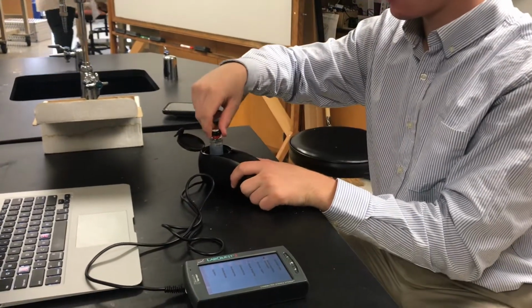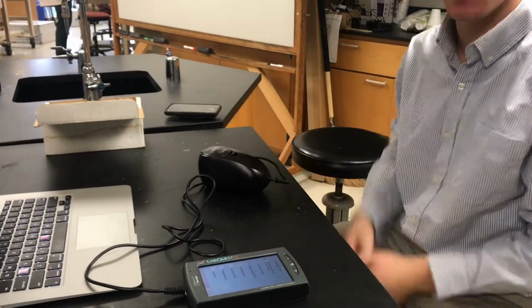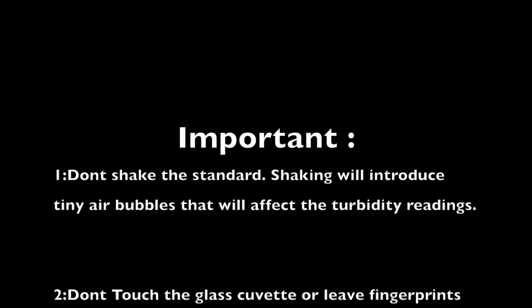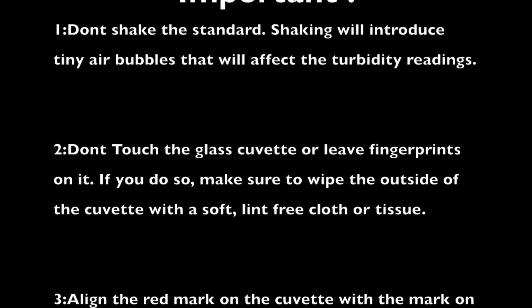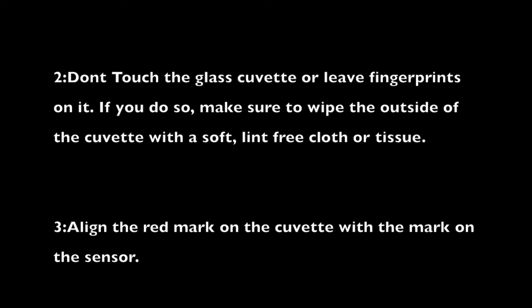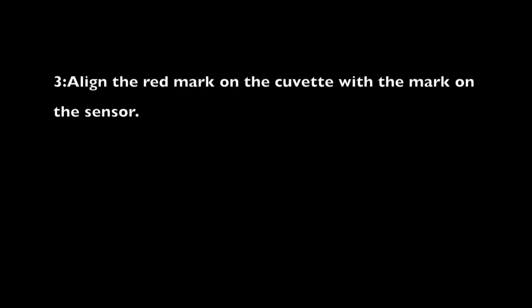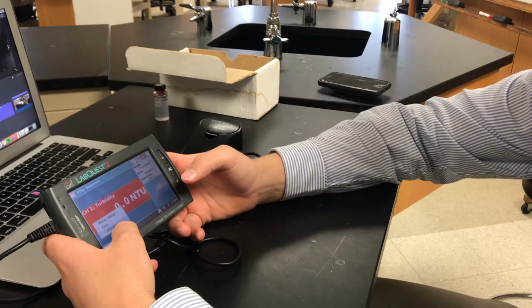Alrighty, the calibrator. Line it up with the arrows. Be careful with it and don't get any fingerprints on it. To calibrate.